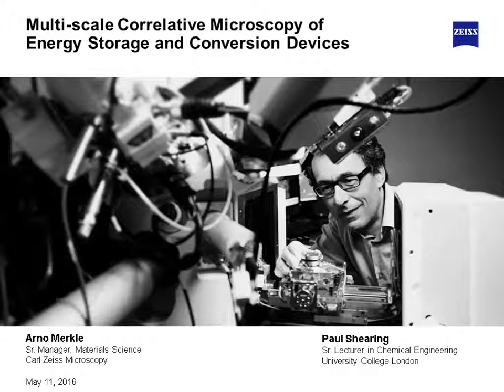We often use Visual SI Advanced, a capability developed by a company named ORS, who we collaborate with quite closely, and it performs all sorts of geometric analyses, but also segmentation. But really, it's about tying that link back to using that information to dictate the imaging strategies. You'll find out information once you've quantified the data, and oftentimes you'll want to go back and image it with a different microscope or at a different resolution on the same microscope. So we see that need quite a bit.